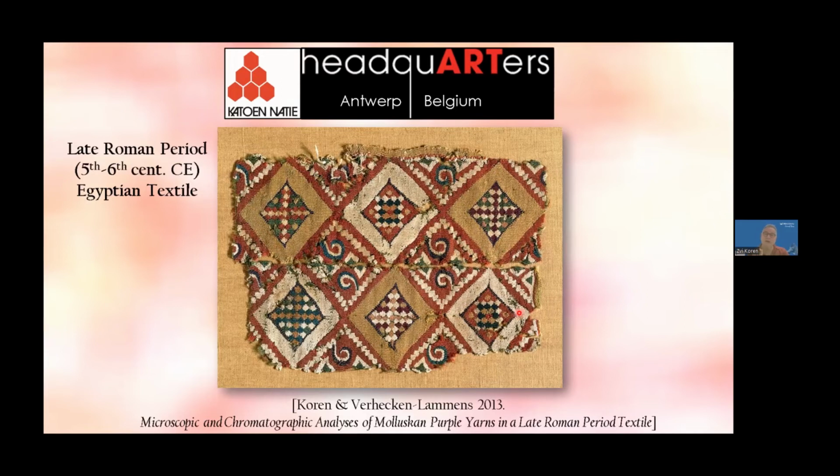And for this beautiful textile, 1500 years, it's not very ancient, we learned some extremely important caveats involved with archaeological textiles that have purple. Now, under the microscope, when I first did an analysis of some of these yarns, I got a nice molluskan pigment. But then looking more carefully under the microscope, I could tell that each yarn that I was analyzing really was composed of 3 different colors. You can see even here, there's a blue, a reddish, and a yellowish. Well, the yellowish is undyed wool. As you know, wool gets yellowed, oxidized over the years, and it turns yellow.